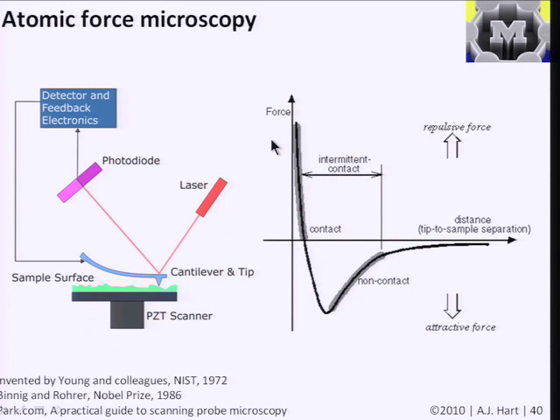Okay, so the analogous technique to STM is atomic force microscopy, or AFM. And here you have the same idea of a sharp tip and a substrate, and you want your tip to be as sharp as you need it to be, but instead of using electrical interactions or this electrical tunneling current where you need to have the tip and sample conductive, now you are relying on physical interactions between the tip and the substrate. And this is the topic of the paper that I have in the readings folder for today. And so here you actually physically scan your tip over the surface. And you can scan it in various modes. You can actually drag it, or you can sort of bounce it in what's called tapping mode.